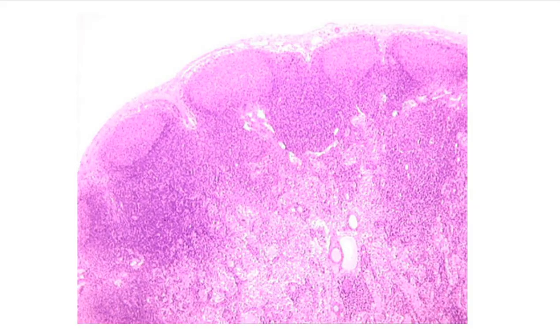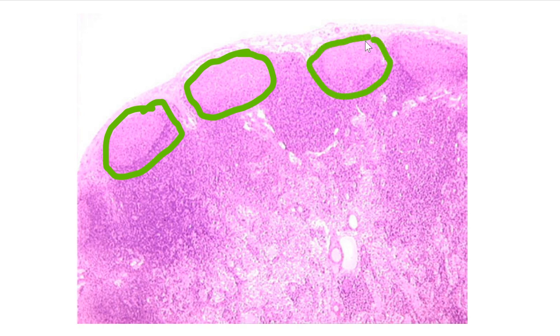So the follicles, and here's another image where you can see that it's just a different shading, so you can see a different perspective of if the slide is shaded with, say, pink, or if we're going to use a purple shading, whatever is used.